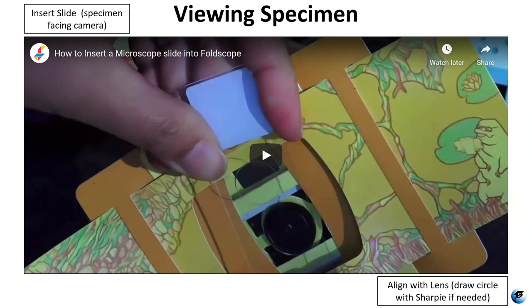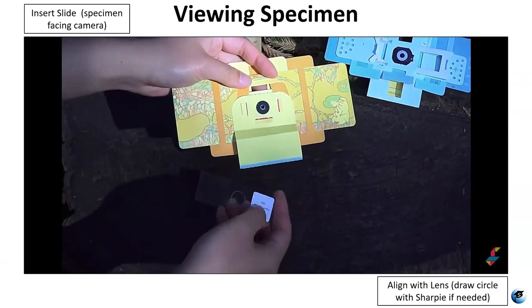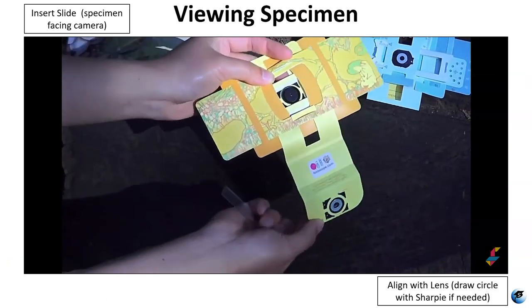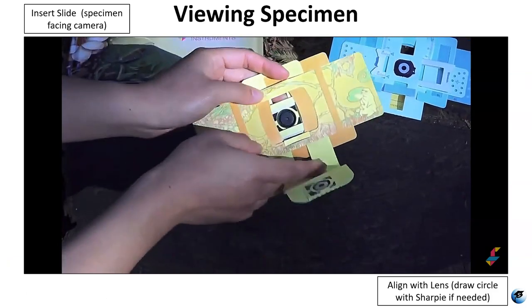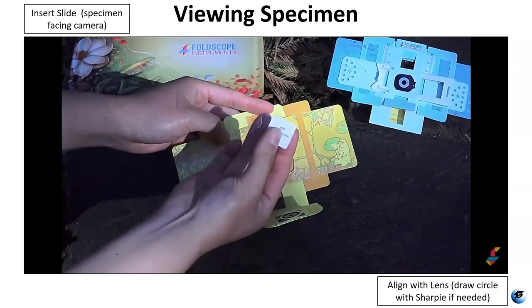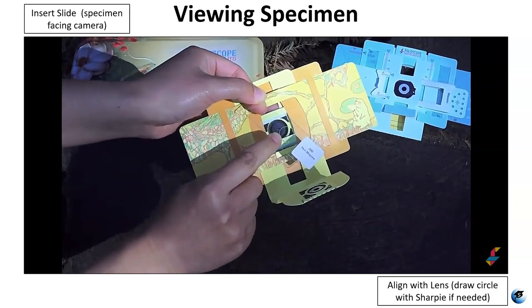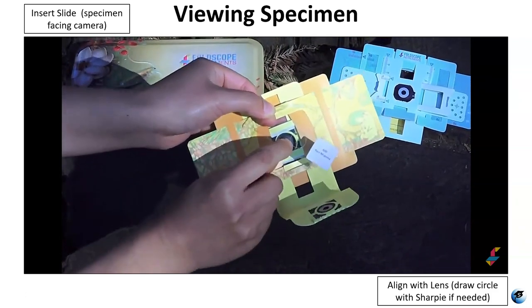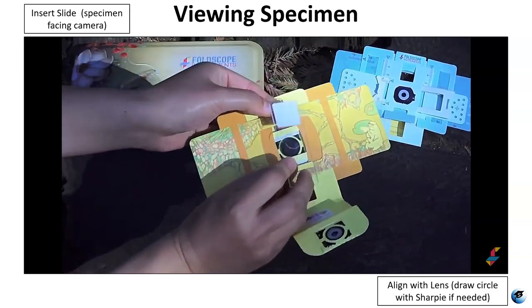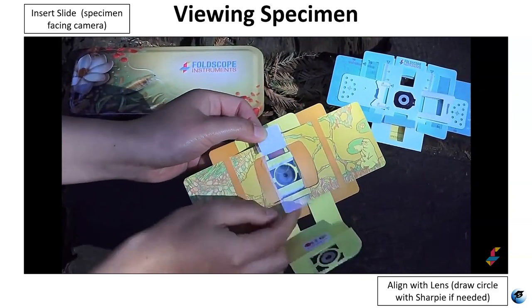This is another video that illustrates how to insert the slide properly into the Foldscope. You want to make sure that when you're putting the slide in, you're inserting it such that the specimen itself is facing the camera. You're going to put the slide where the arrows show you, using the little yellow tabs. Put the specimen facing the lens.